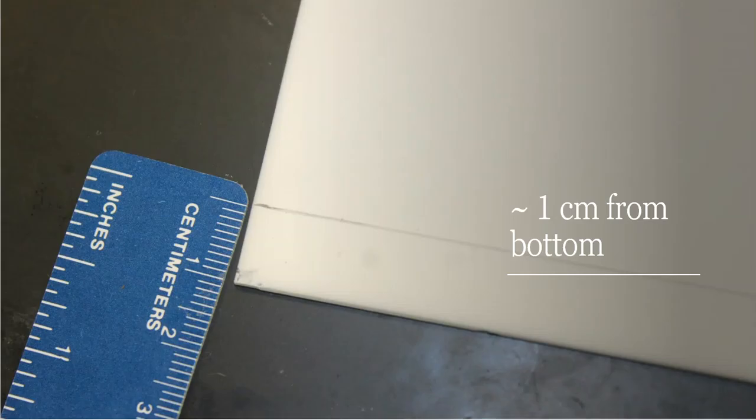All right. So before I do any prep at all, I'm going to come around, and the directions tell me to take your plate and measure at least 1 centimeter up from the bottom of your plate.